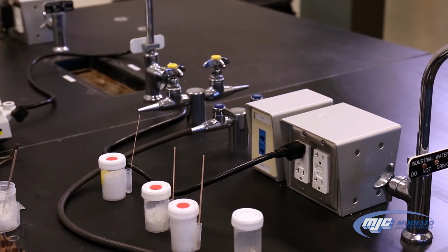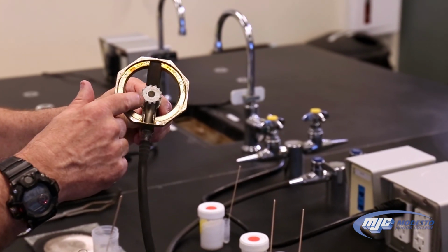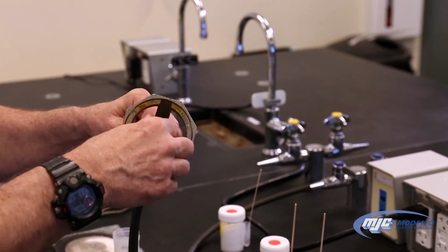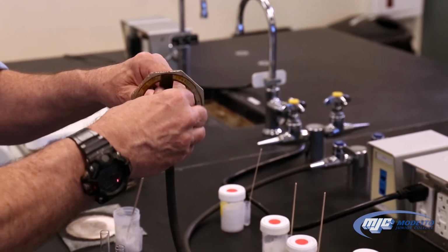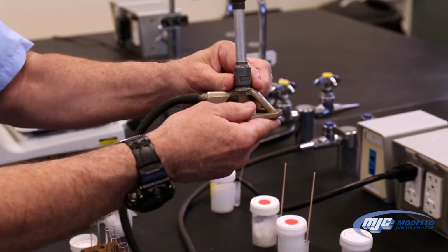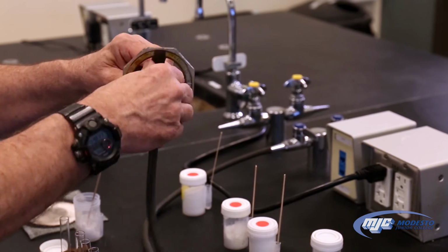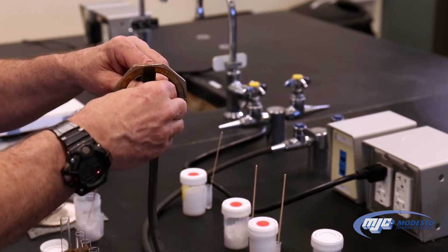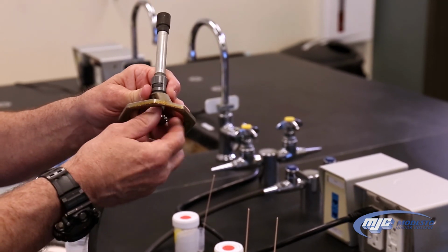That's the first control. The next control is on the bottom of the Bunsen burner. There's this little knurled handle. This is a needle valve, and what this does is control how much of the fuel gets to the flame. The only thing we have to be careful about is that if we back this out too far, it will come all the way out.